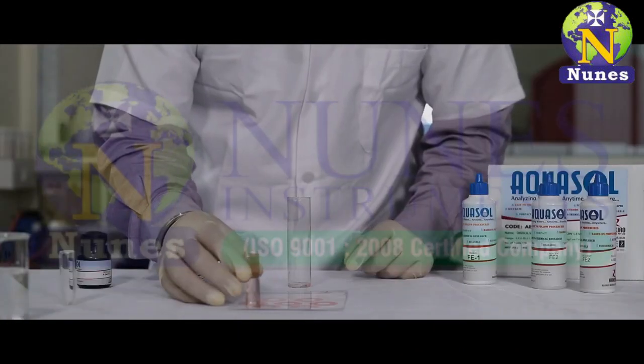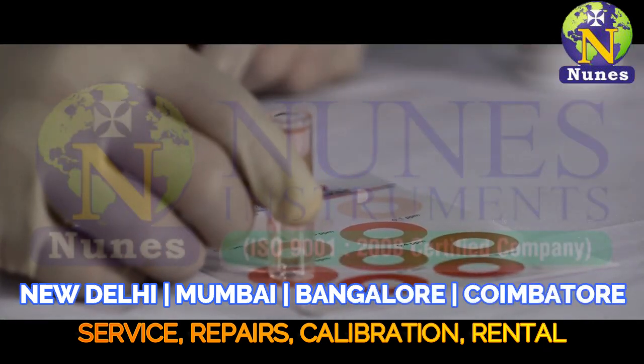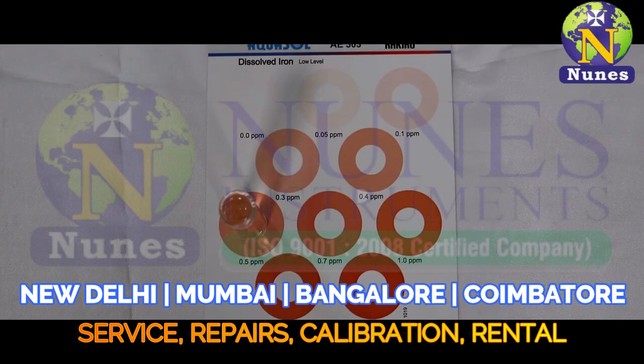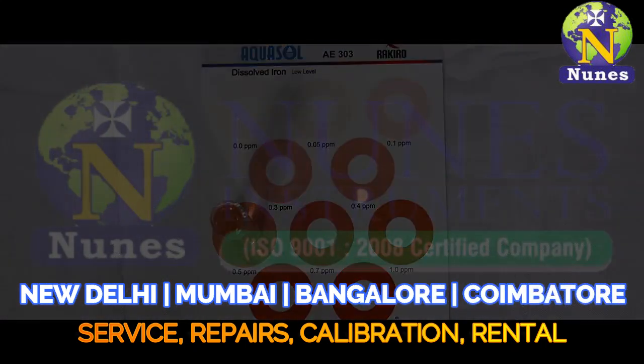Place the comparator tube on the white inner surface of the color chart to find the match for your color obtained. Make sure you are viewing from the top of the tube. The matching color indicates the value of your sample.